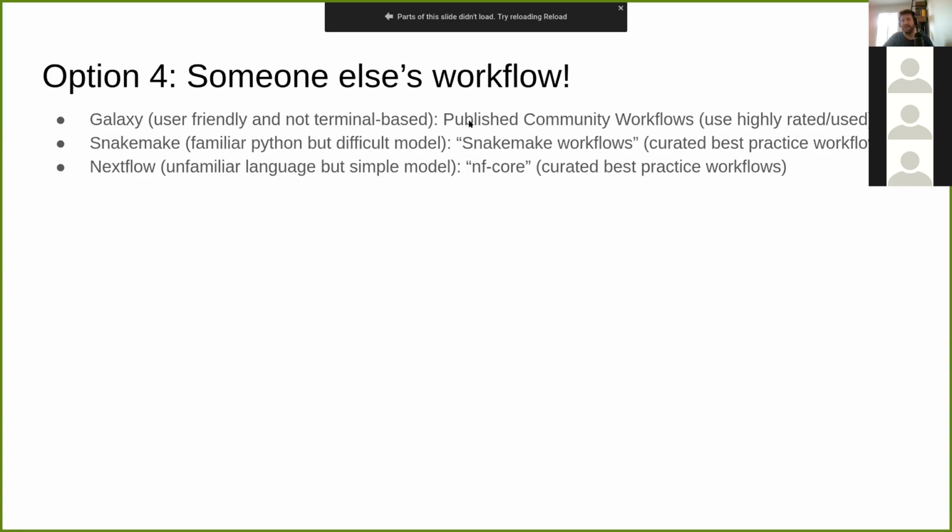The nice thing with these guys is they have Snakemake workflows, which is this curated set of best practice workflows. There's a nice set, usually led by the developers of Snakemake itself, of these really high quality workflows that do a lot of checking of your data and things like that.